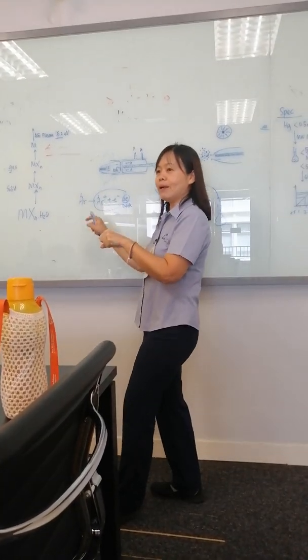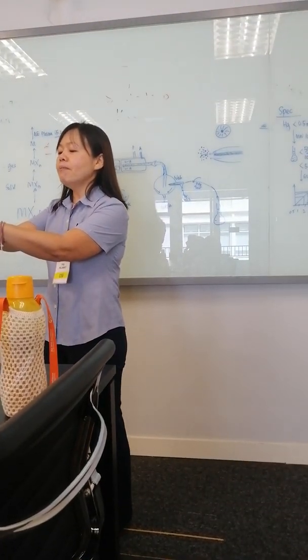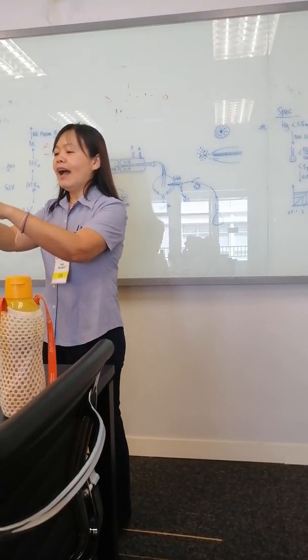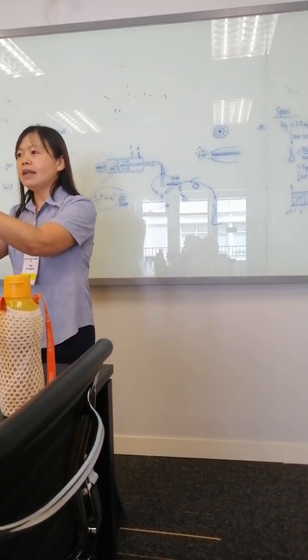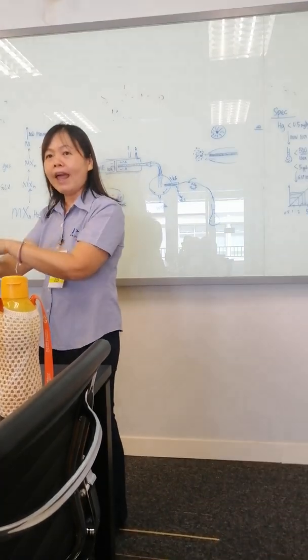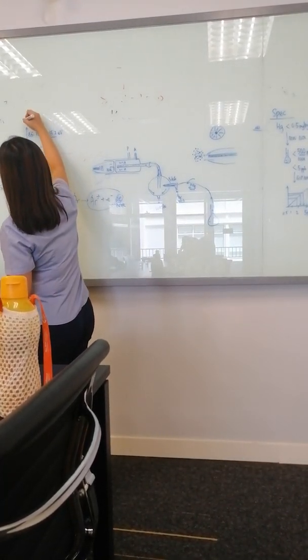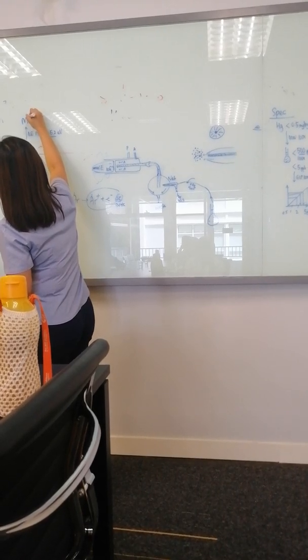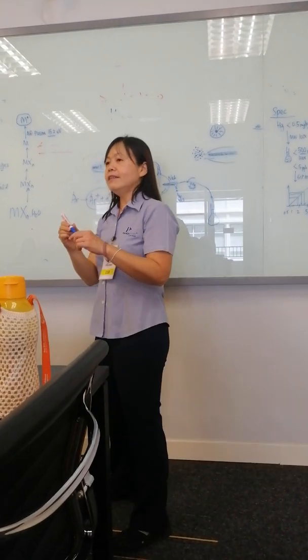This seed of plasma will collide dengan you. What happens is the moment I collide, the plasma with a lot of energy will transfer the energy to the free atom here. So to your cadmium, to your lead, to your mercury. Once they receive the energy from plasma, they become a singly charged ion. ICP-MS must have a singly charged ion.